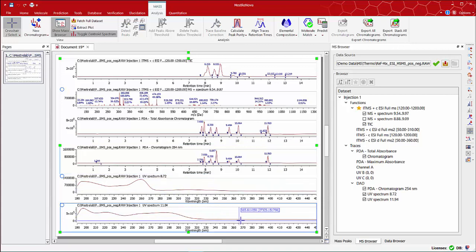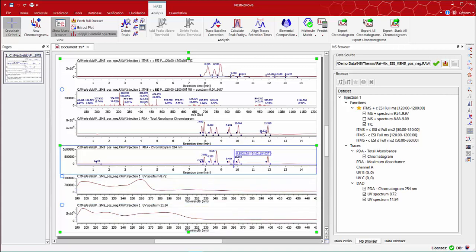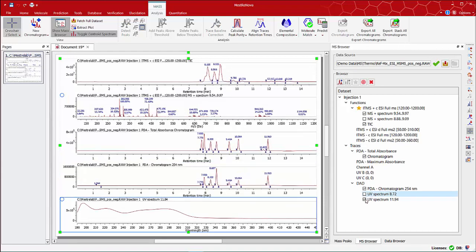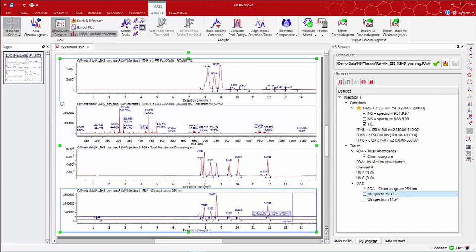Since this was just an example, you can easily go back to your MS Browser panel and remove the selected boxes to tidy up the main window.